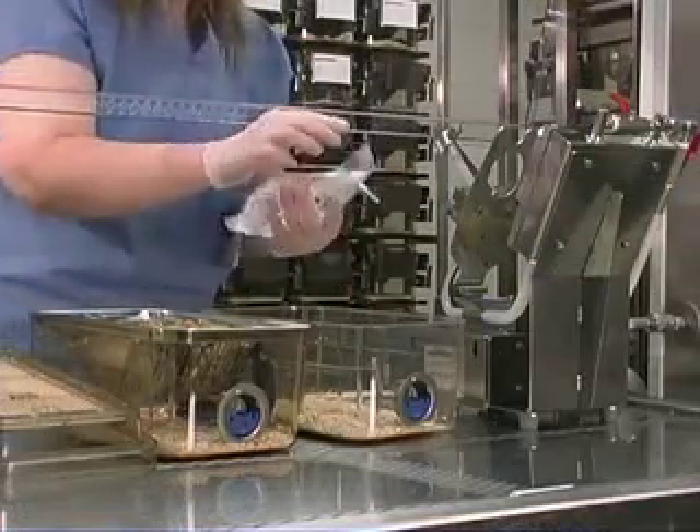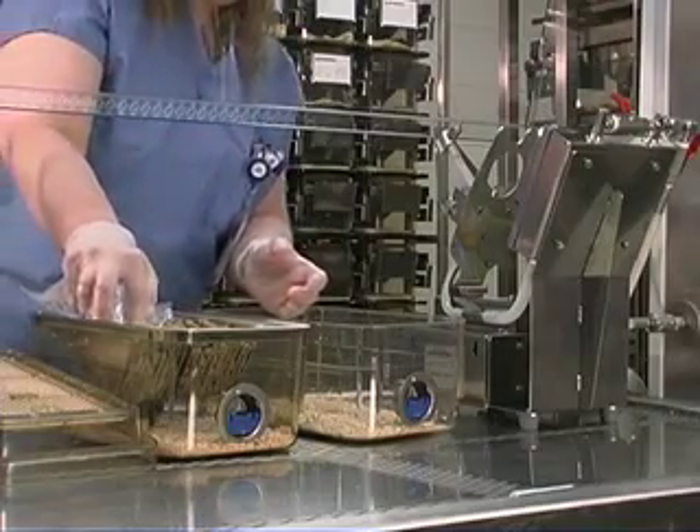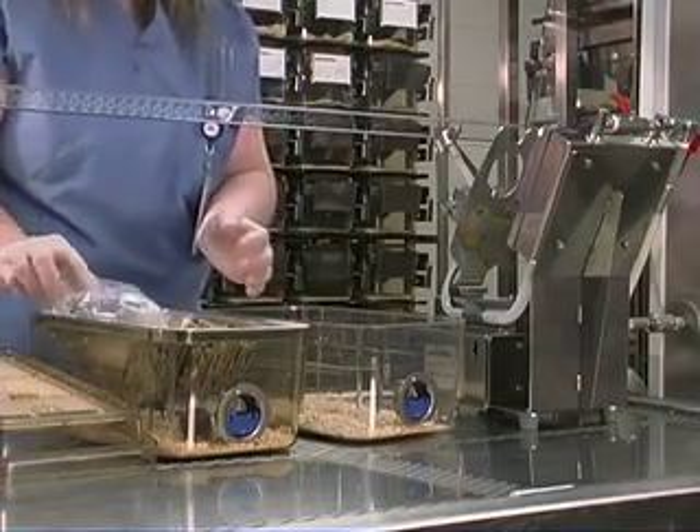The Sippersack system is not only a new product, but more importantly, is a smart task concept that will improve the way you work.